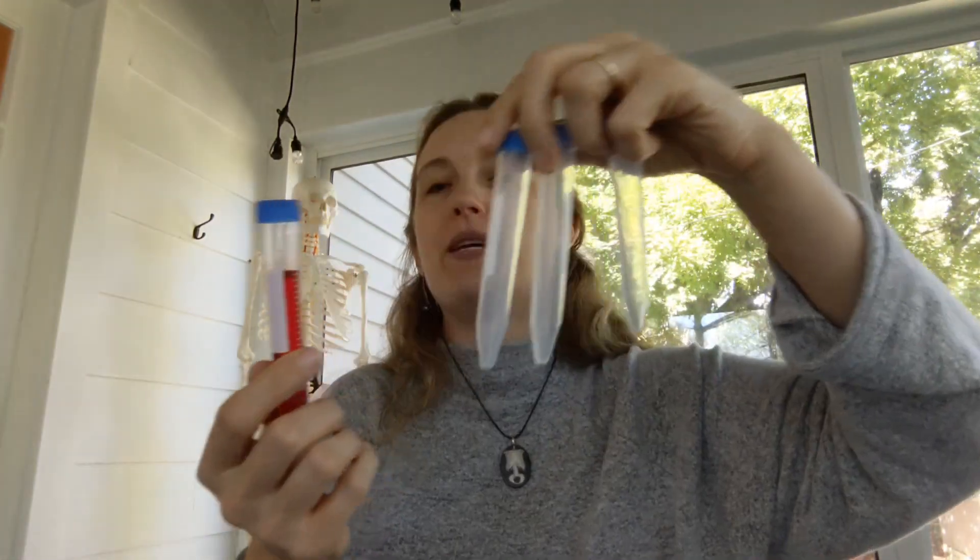If you want to make this more challenging, I have in the past done things like given each team their own tube and the concentrations vary. And so I might label those tubes A, B, C, D. Every team gets their own, but probably you don't have a lot of extra time right now, and it's much easier to give them all the same.